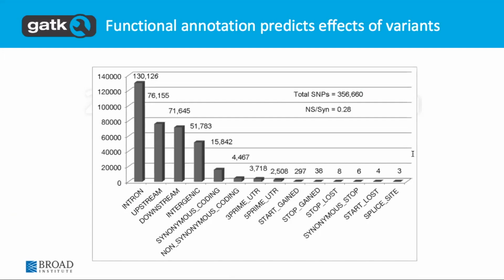And so Funcotator annotates your VCF and produces the classification of each variant.